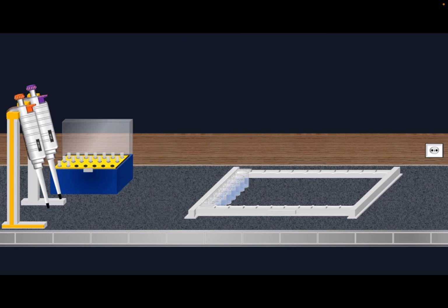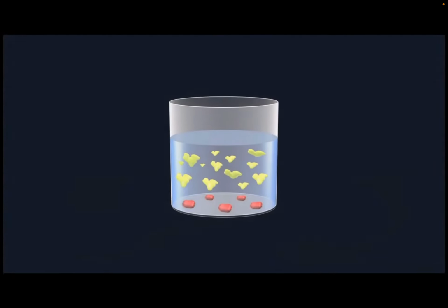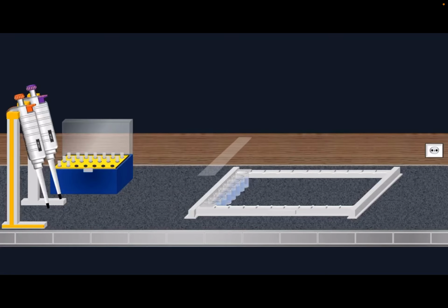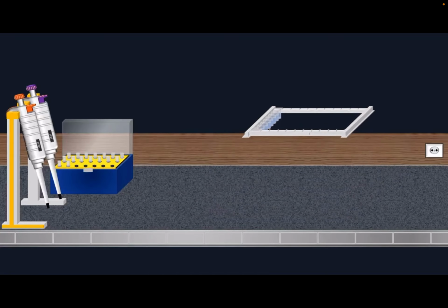The proteins in the blocking solution create a barrier on the plate, preventing the target antibody from binding to these sites in subsequent steps. Once the blocking step is complete, the adhesive plastic is removed.